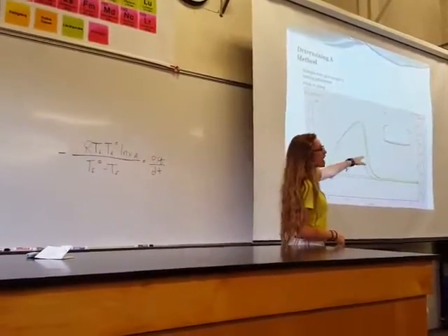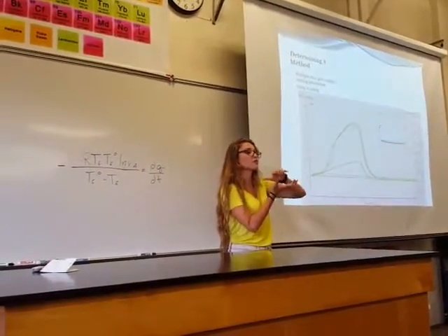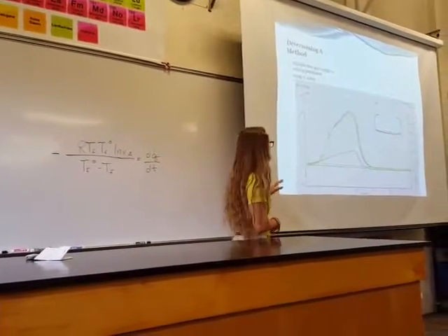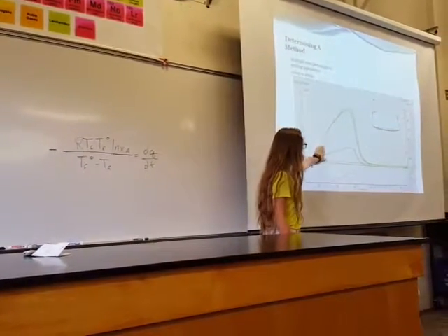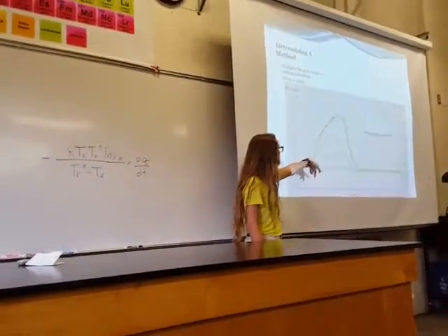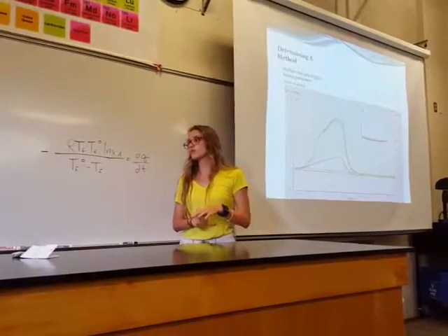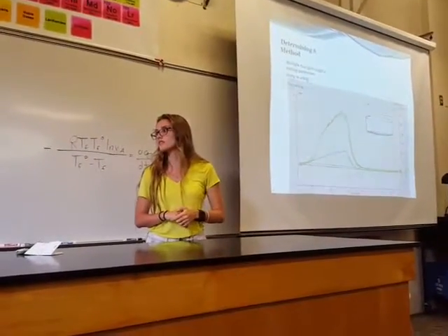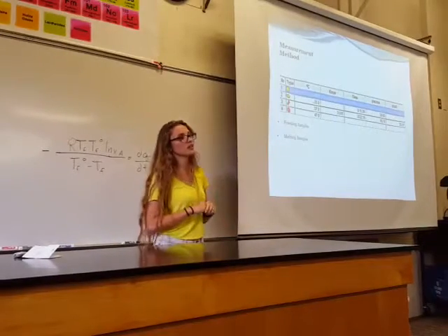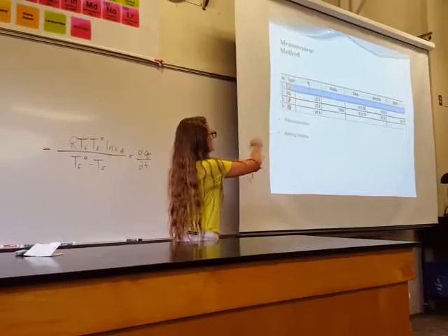And this could have been happening because the capsule was just too full. 40 microliters might have just been too much, and so this uneven freezing was happening. And so we did decide that because of this uneven freezing, or the variance in the incline of the curve, the 20 microliters was a lot safer to go with. It was a lot more precise between runs. And so we finally were able to come up with our standard method for freezing and melting.